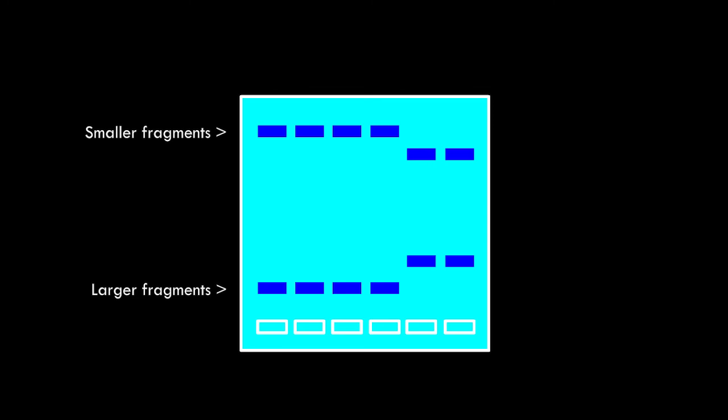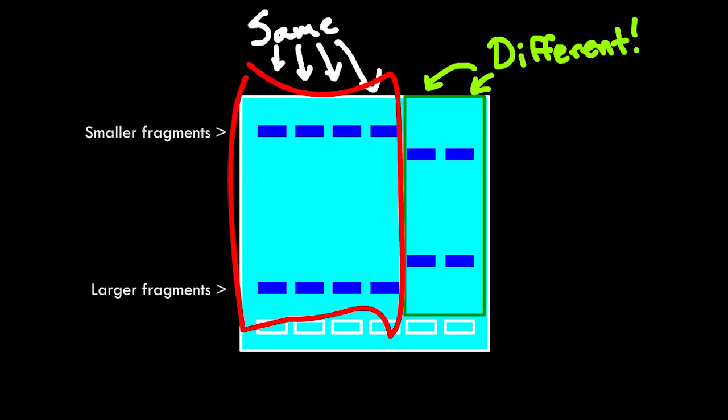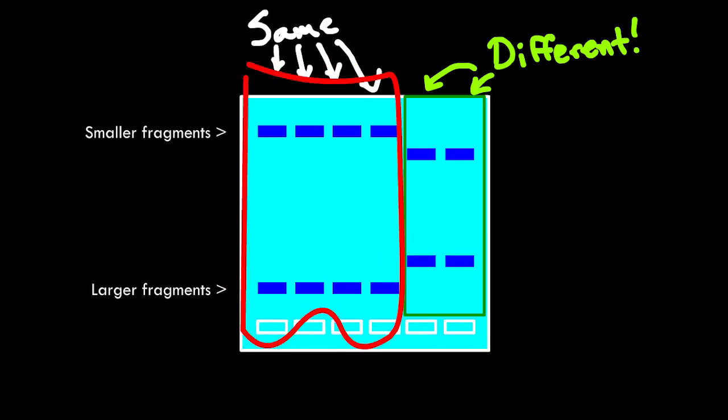Now we have a visual way of comparing one DNA sample to another, so we can tell if the two samples come from the same person or from two different individuals. This lab will identify a suspect in a crime. A similar method is used in crime labs as well as genetic testing labs screening for diseases, mutations, or other genetic abnormalities and similarities.